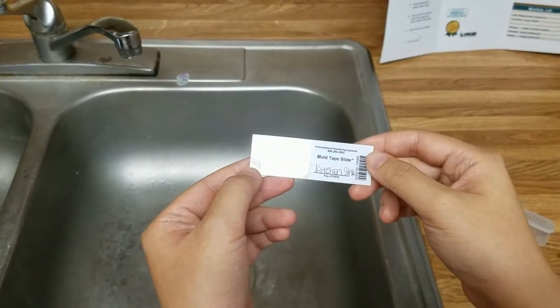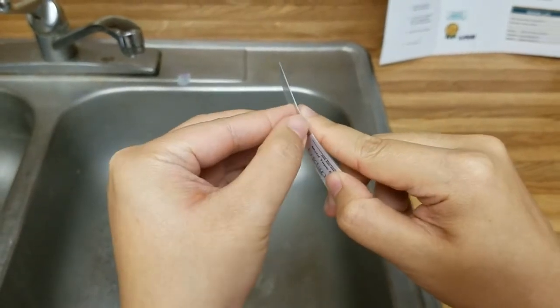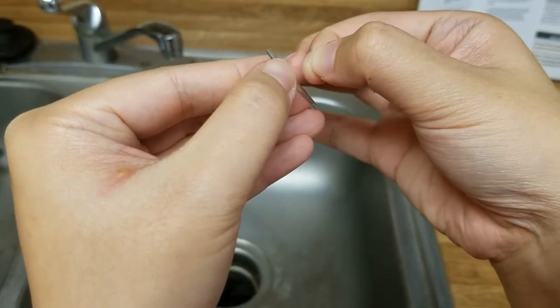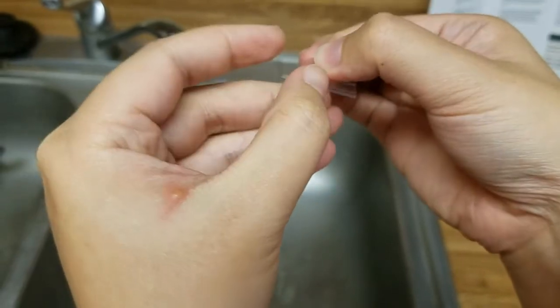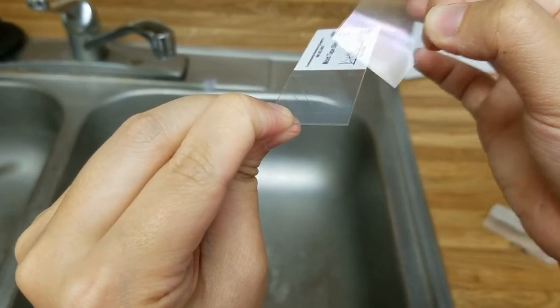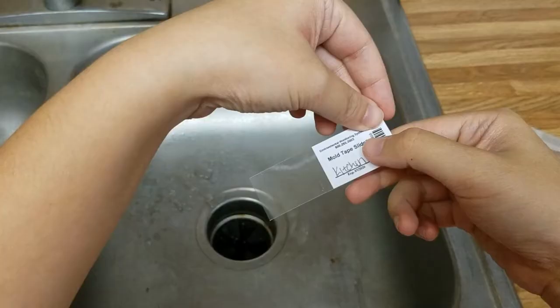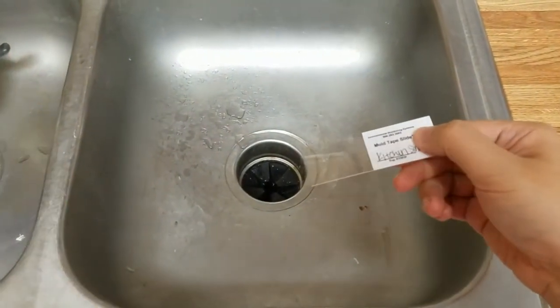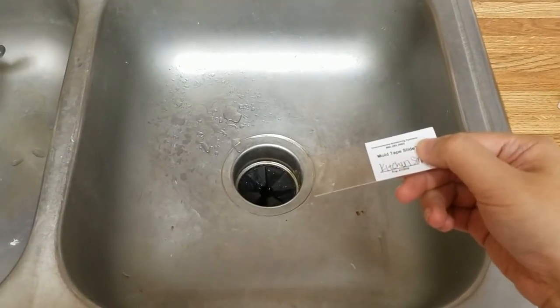Next, we need to peel off the seal from the slide so we can get to the sticky part. It's really hard to notice, so make sure to get this part out. Make sure not to touch this part with your hand. I'm going to place the sticky side right here — I didn't touch it — to where I think there might be mold.